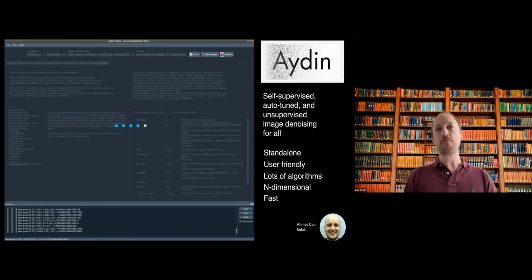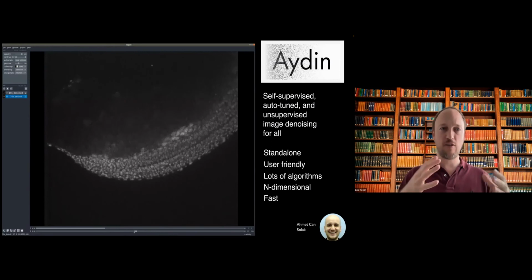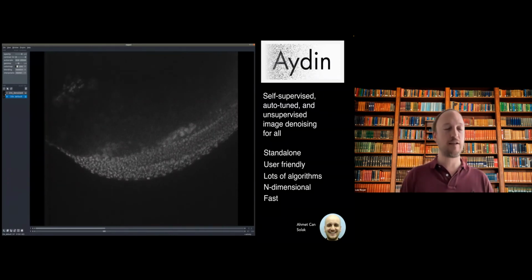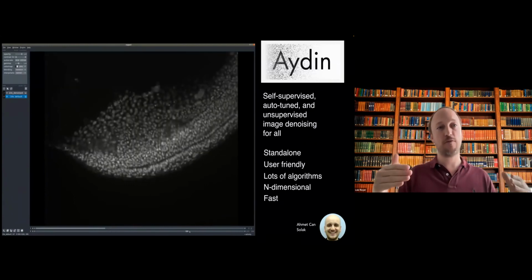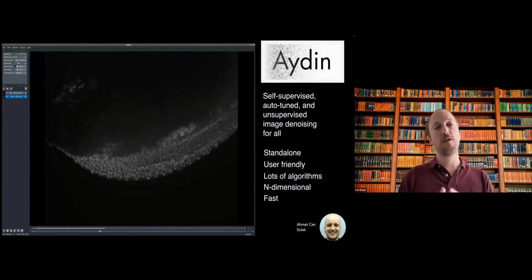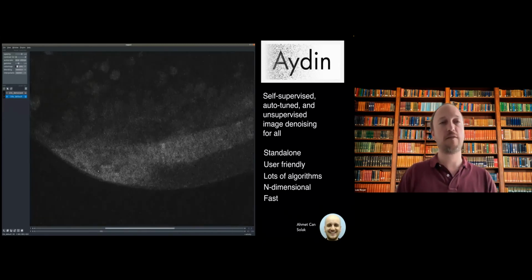And so if you want to really ship something to users and make sure that it really works for them, that poses a lot of issues in terms of packaging and so on. But you can embed Napari within such a complex application that has a lot of constraints in terms of packaging and distribution and so on. You can still do that, and Napari works great. It just offers a fantastic viewer within your application that you can use to view the data, and you have all the benefits of Napari within that.